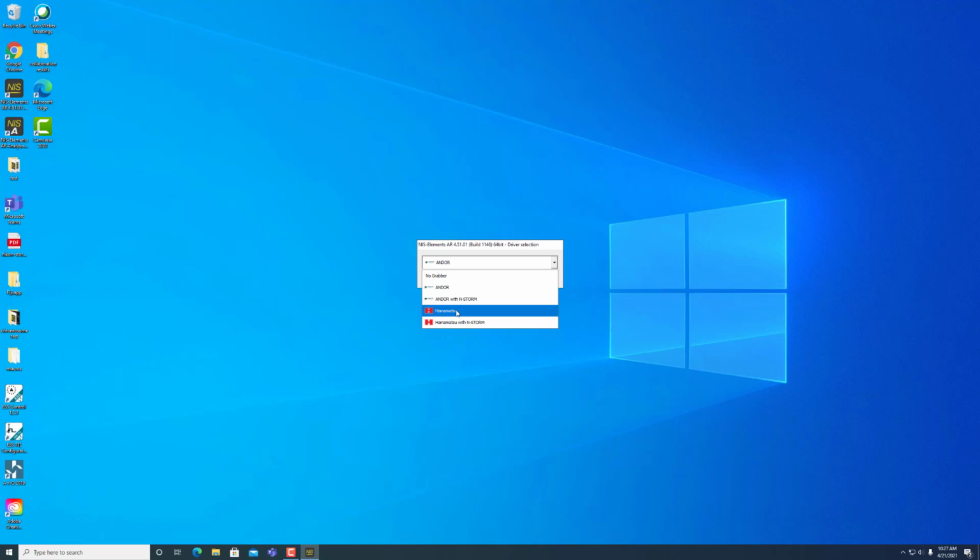However, it is a faster camera, so it can take a lot of images much more quickly. So if you're doing time-lapse experiments where you might need to see some dynamics, you might end up choosing the Hamamatsu. Whereas with the Andor, if you don't mind not having the super fast speed of the Hamamatsu, instead you're trying to detect maybe dimly fluorescent molecules or something to that end. But they're both solid choices. You really can't go wrong with either one for most fluorescence applications. Today, I'm going to use the Andor, and we're just going to hit OK.